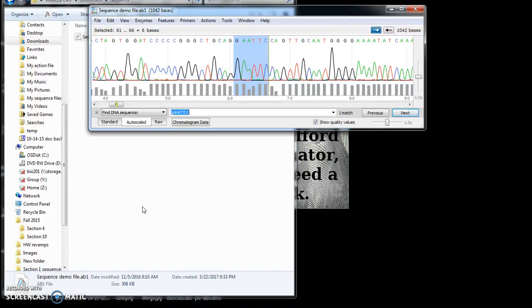We also see that there's only one match, and I'll leave it to you to think about why we would want to see whether there's another one. So this EcoR1 site is the beginning of our yeast insert, meaning everything to the left of it came from pBlue script, and there's no need to copy that sequence to search for it in the Saccharomyces genome database.